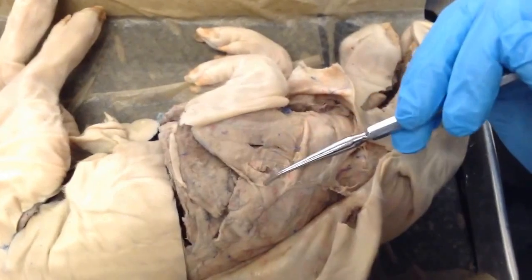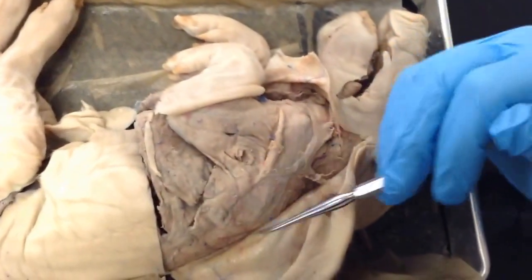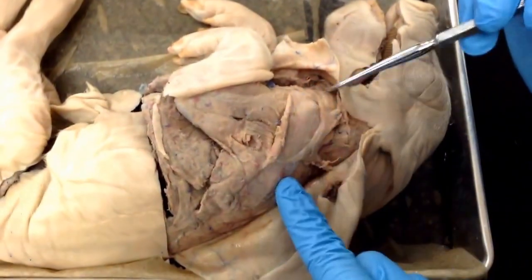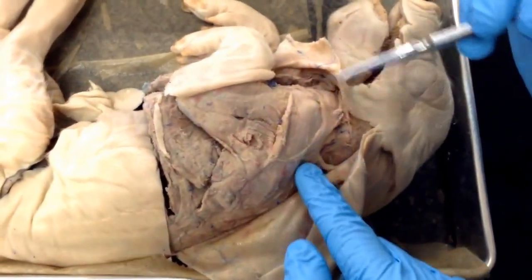And the connective tissue that was ripped through when the pig was skinned was the superficial fascia, and the muscle layer that was directly under the skin is the cutaneous maximus. So those two muscles are the triceps. This whole thing is the spinal deltoid, and that thing is the acromiodeltoid.